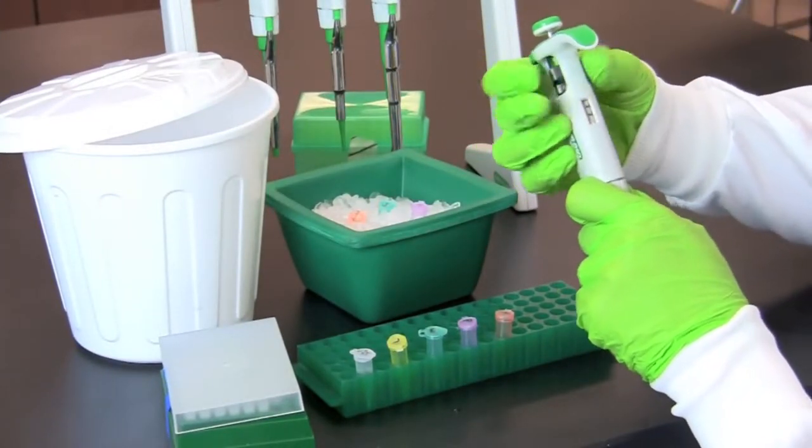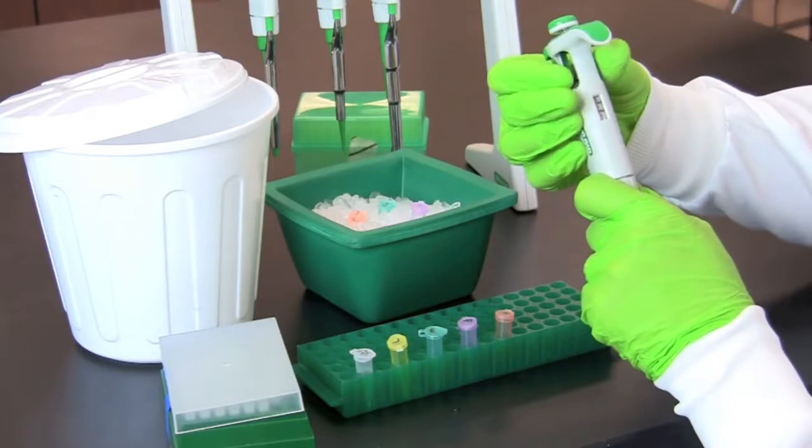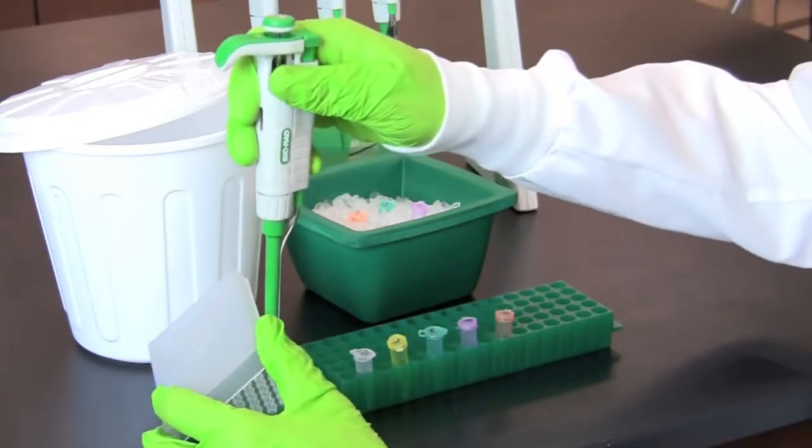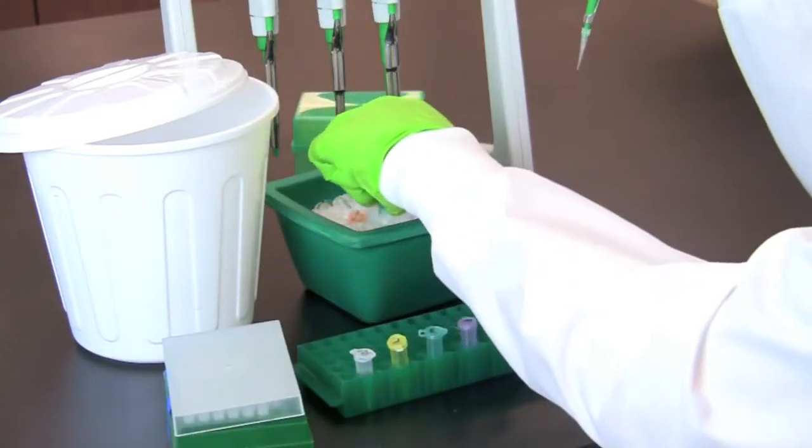Once you have finished transferring 2X restriction buffer to each tube, reset your micropipette and use a fresh tip to transfer one microliter of restriction enzyme to the corresponding tube.